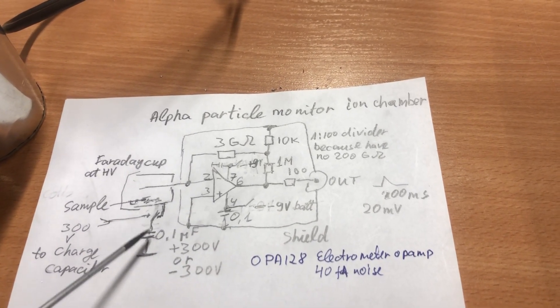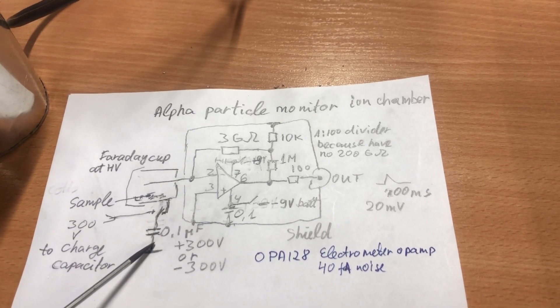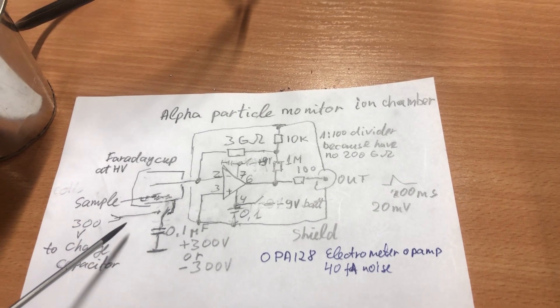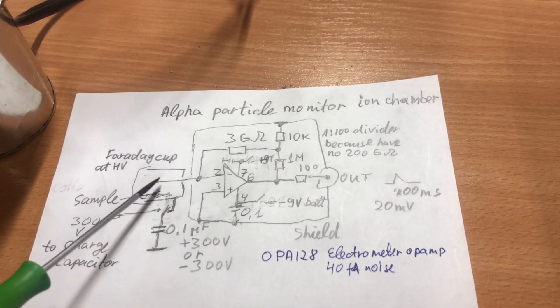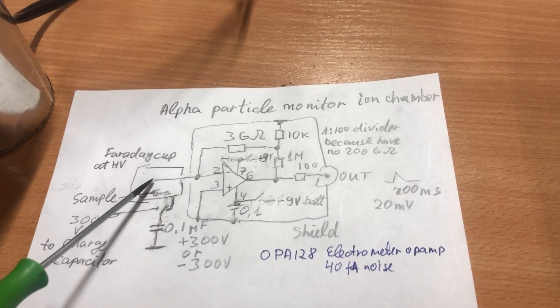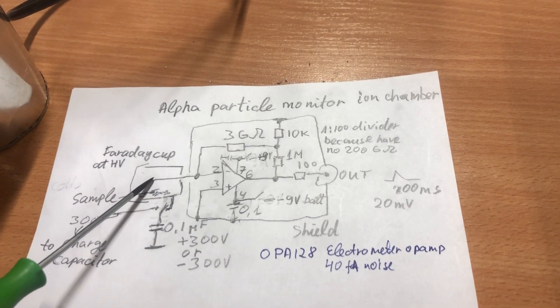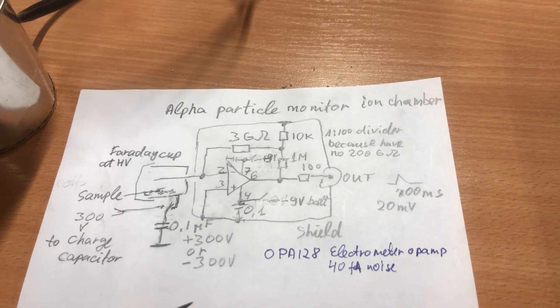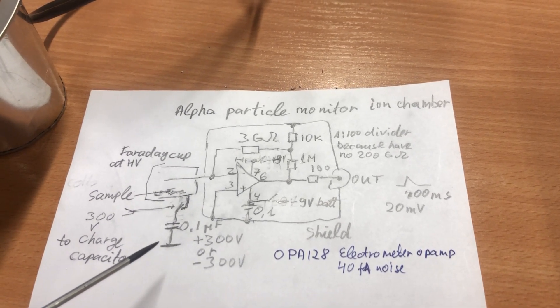Faraday cap is at high voltage, 300 volts, so it is dangerous to touch. Should be careful not to touch the middle wire to the Faraday cap wall. That will electrocute the amplifier.